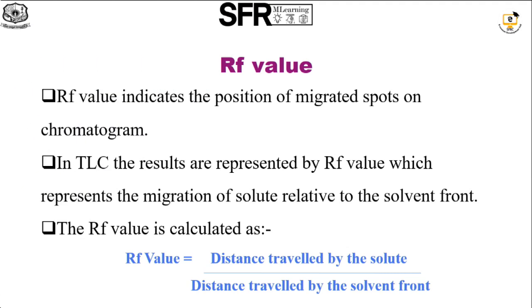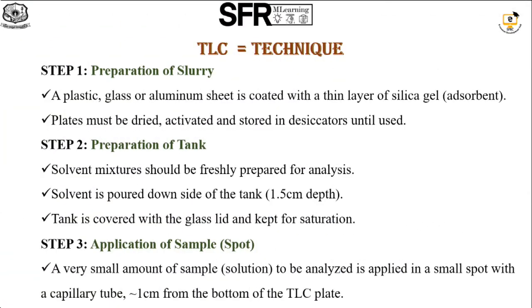Next, the RF value. RF means retention factor. The results are represented by the RF value. The RF value is calculated as the distance travelled by the solute divided by the distance travelled by the solvent front. So next we are going to see the TLC technique.